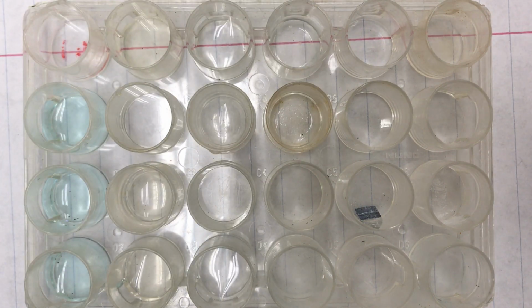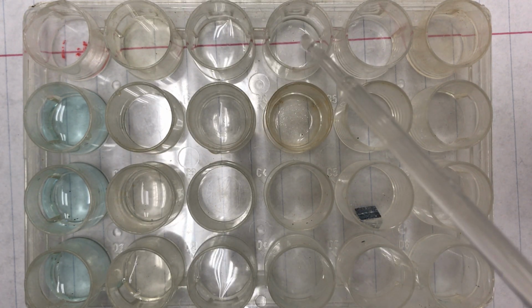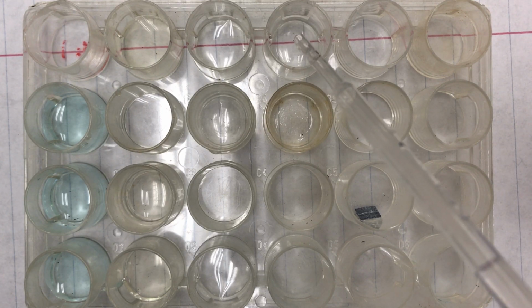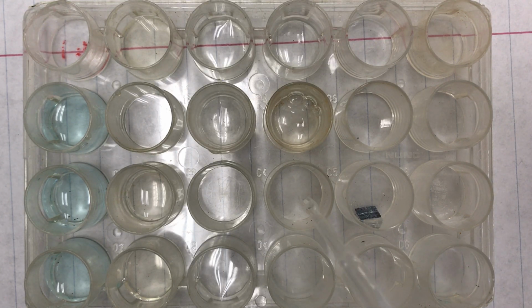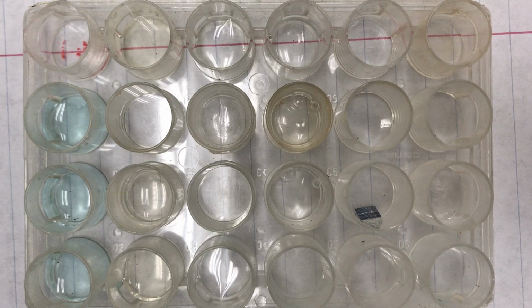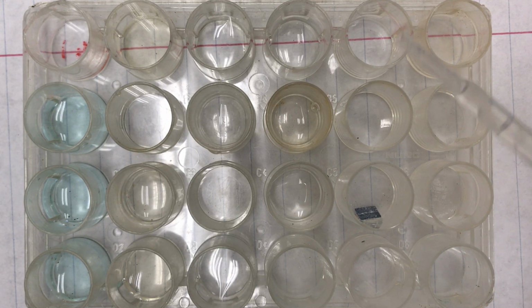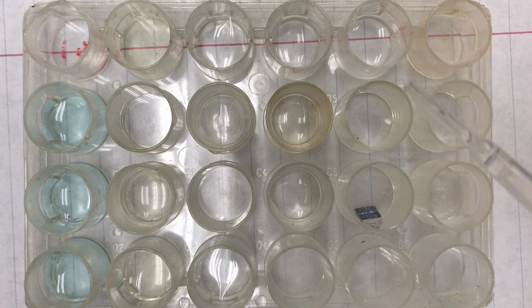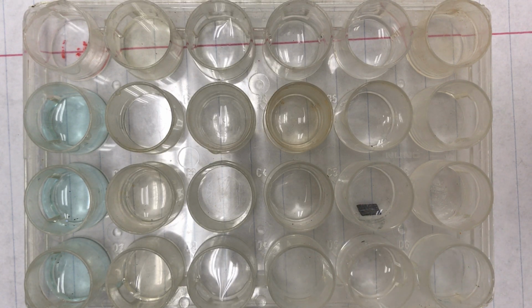All right, then we're going to take zinc sulfate into well A4, B4, and C4. Making note of the color and the state. And then hydrochloric acid in A5, B5, C5, and D5. All right.